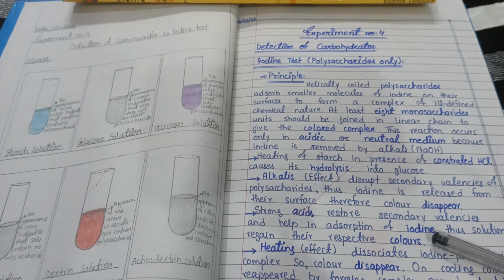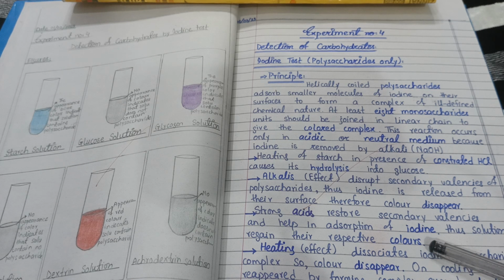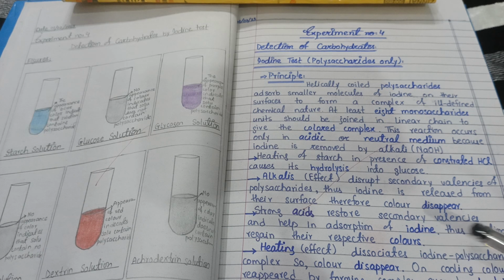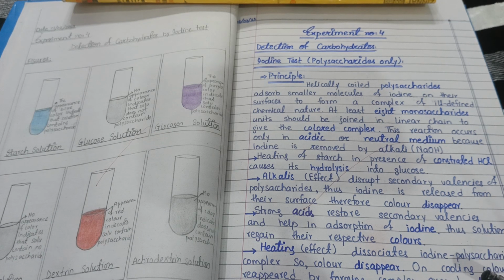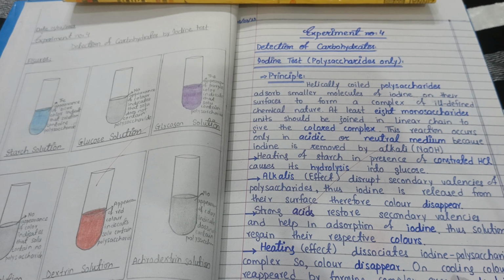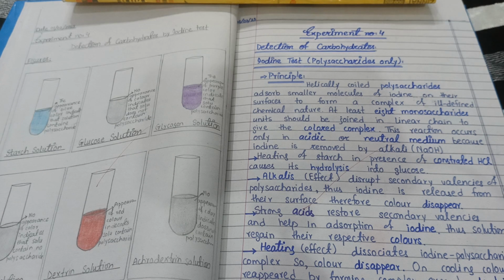Okay, and second thing, you have to maintain the temperature, because whenever you heat this solution, the color of iodine will disappear, and whenever you cool it, it will be restored. But the exception is the dextrin solution, because whenever you heat dextrin, its properties change, so there is some distortion and structural breakdown in it.